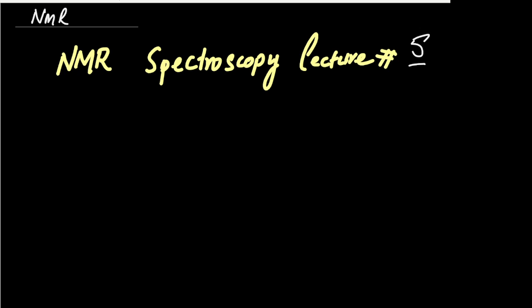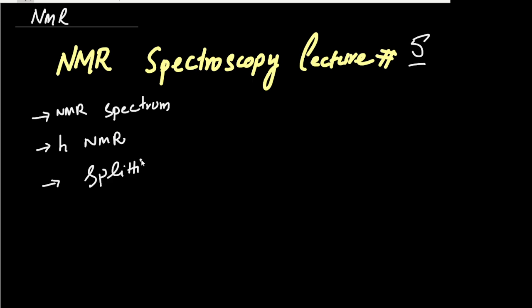Hello, welcome to the NMR spectroscopy lecture number 5. In this lecture, we will study how to interpret NMR spectrum. We will focus on proton NMR spectrum. In order to interpret the proton NMR spectrum, you need to know about the splitting. What are the proton NMR shift values?